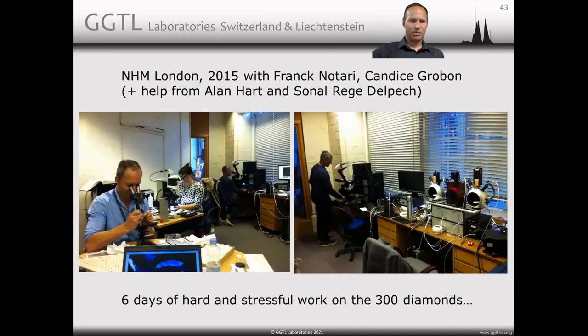It took us a day to install all the equipment, a day to get all the equipment out again. So we were on site for a total of 7 or 8 days. And with the help of Alan Hart and also Sonal Rege Delpech, we tested as many diamonds as we could. So we had a total of 300 diamonds that we tested in 6 days. Part of them were the greens of the Natural History Museum, and parts of them were the stones of the AURORA collection of Alan Bronstein.